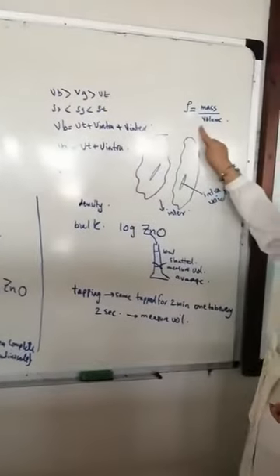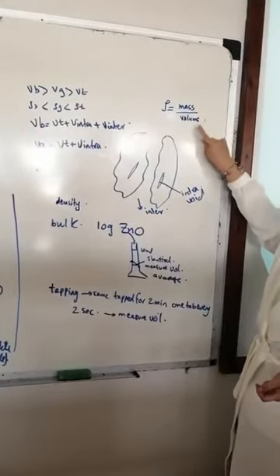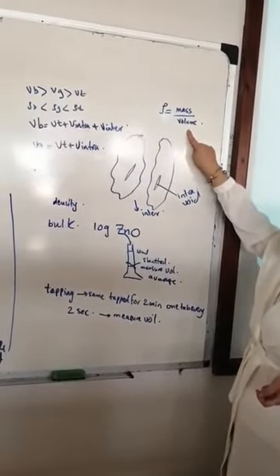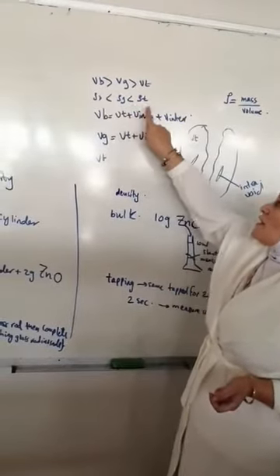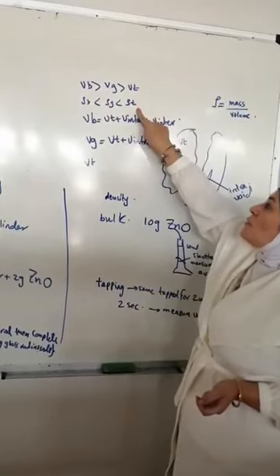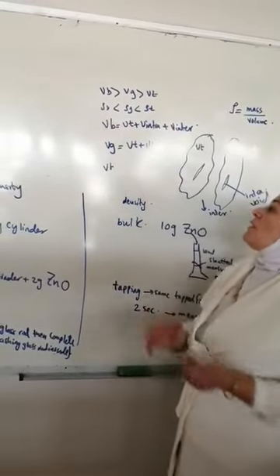As we know, we can calculate the density of a powder using an equation, dividing the mass by the required volume. According to the volume measured, we can get three densities. We can rank the densities accordingly, because the true volume is the smallest volume, which gives us the largest density, compared to the smallest density, which is the bulk density.